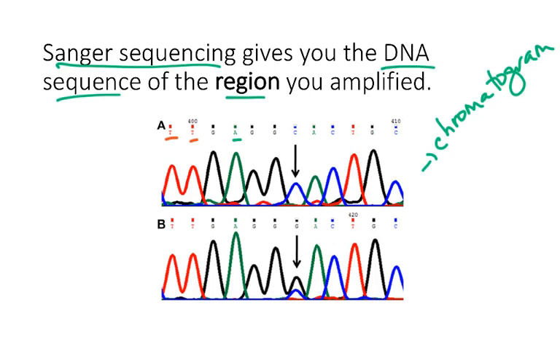And remember, that DNA sequence you get is only for that particular region you amplified based on the design of your PCR primers. So in this example, if we want to give it some more context so we can think about what that might look like more in the real world, say we have the state of California. Yes, that's my excellent drawing of California.